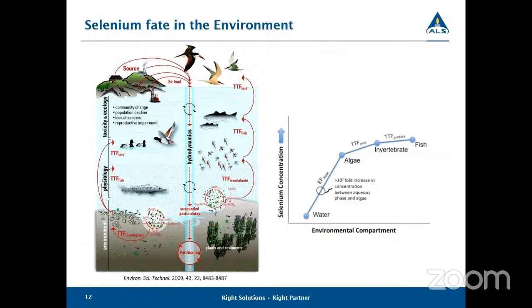Okay, and how do you handle polyatomic interferences with the ICP-MS? We're using a collision cell ICP-MS, so it is using a reaction gas. When we're analyzing selenium, it's removing any polyatomics.